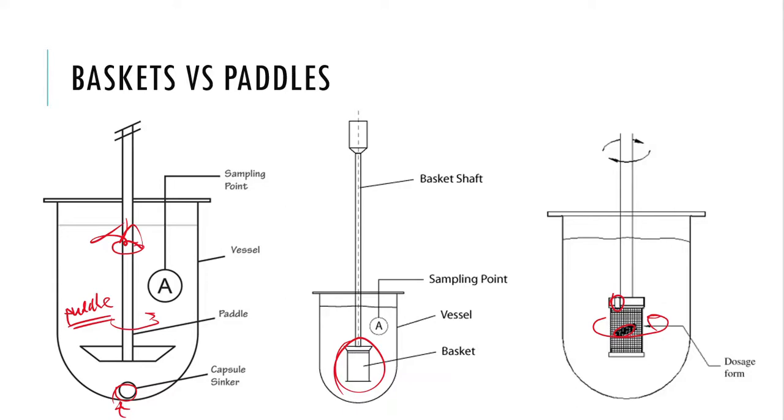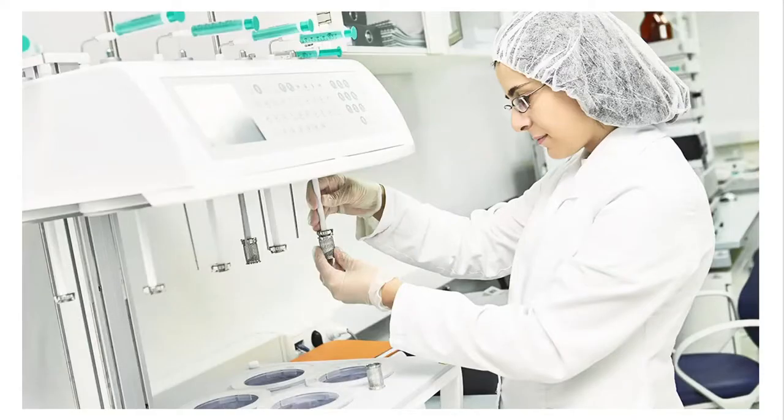And that's basically what that means. Okay, this image is showing you a laboratory worker that is over at a dissolution system. And as you can see, this basket is getting ready to either be pulled off or she's putting it back on. And if she's putting it back on, there is a pill on the inside of this. So they are prepping the dosage. They are prepping the basket here. And that is what those systems look like when we need to use them. Okay, so other than that, folks, I'm telling you, dissolution, super simple. There's not too much that needs to go into the description of this, because once more, it's just measuring how the pill is breaking up over time.